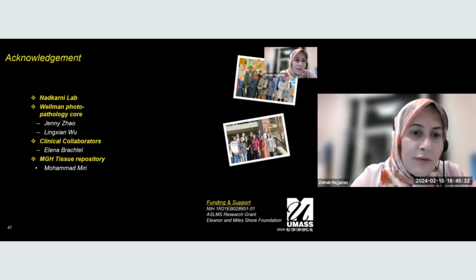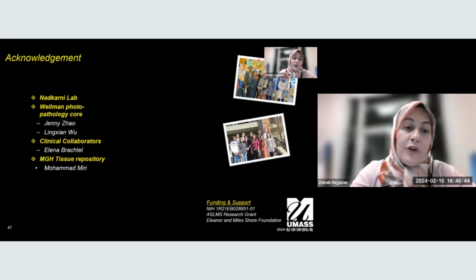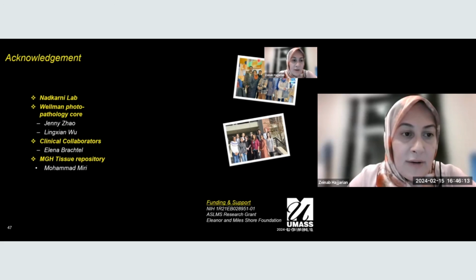I forgot the second part of your question. How long do you have to collect the data to tease out all this information? You have to have a time course, right? Right. For each 500 by 500 micron area, it takes us 1 second. For a bigger piece of tissue, like 2 centimeters by 2 centimeters, with the newer M2 SSD drives that increase the writing and reading speed of the speckle frames to the computer, it would take about 10 to 15 minutes to image something that is 1 centimeter by 1 centimeter.